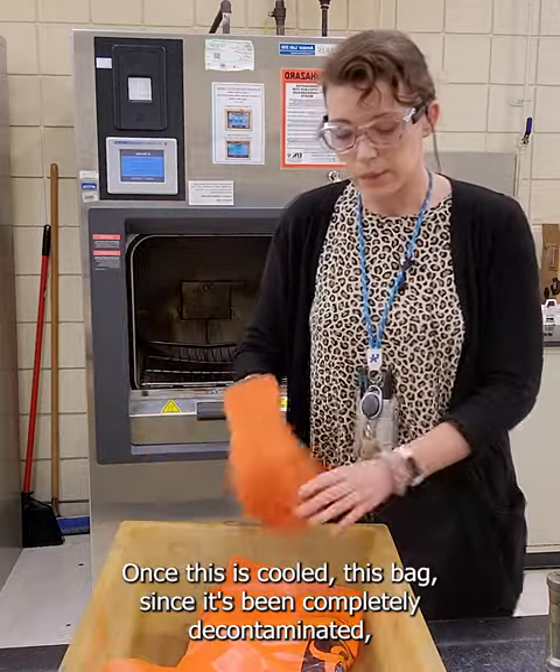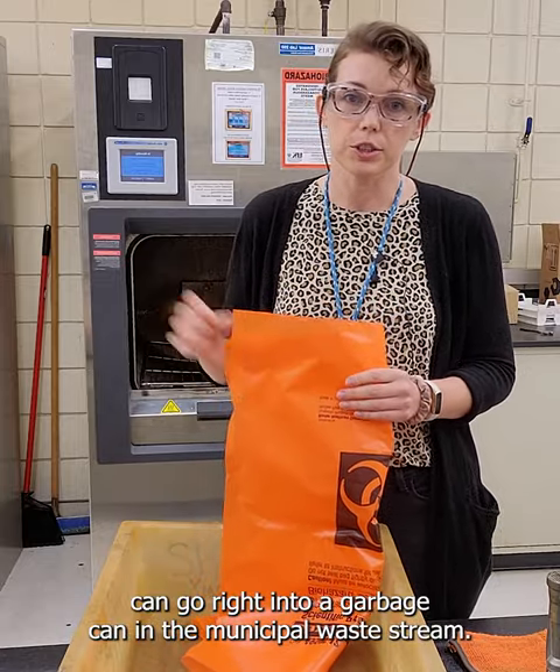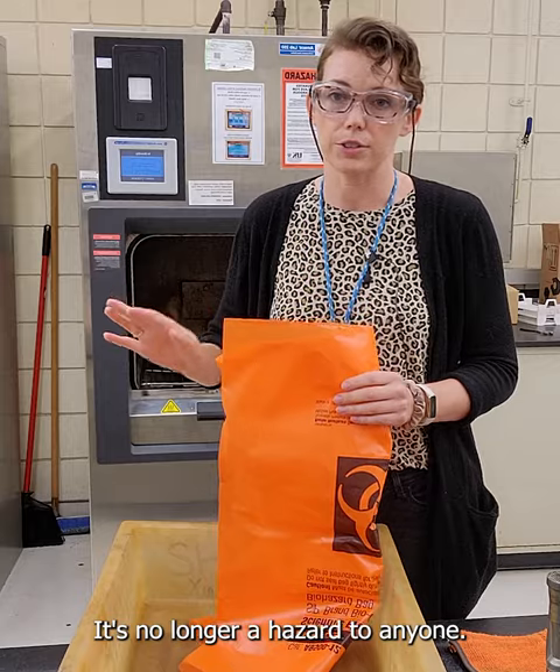Once this is cooled, this bag, since it's been completely decontaminated, can go right into a garbage can in the municipal waste stream. It's no longer a hazard to anyone.